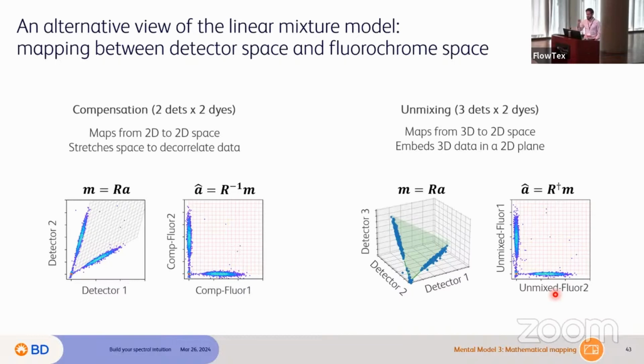But there's another way. This is the value of going through the math, is that when you look at the mathematical representation, it unlocks a whole bunch of other ways of looking at the same problem, some of which have useful solutions or concepts that you can apply to your problem. So one example of that is that these linear mixture models, they aren't just representative of like solving these kind of sets of equations and making matrices. They actually have a really clear geometric meaning, which is it lets my data go from one space to another space. And that may not sound interesting. Sorry, but I can explain what that looks like in an actual data example.